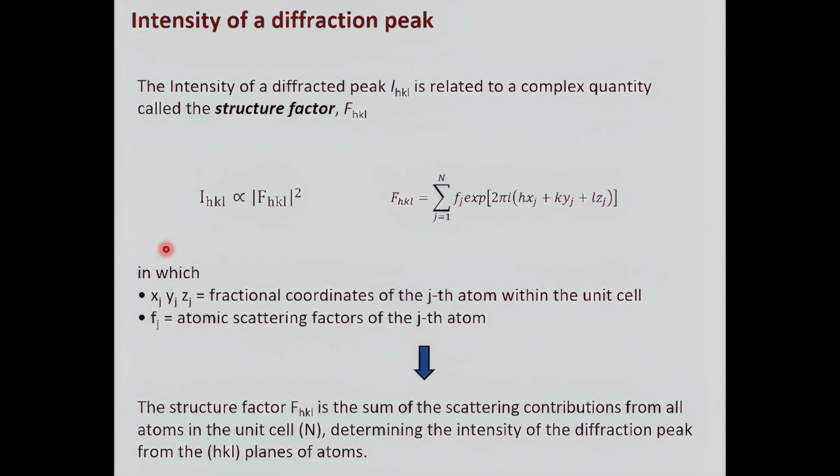Why is the intensity so important? The intensity is the integrated intensity, which is the area under your peak that you can measure when you perform a diffraction experiment. It's important because it is related to the square of the modulus of the structure factor, this new quantity, F_HKL. The structure factor is a complex quantity given by this formula.